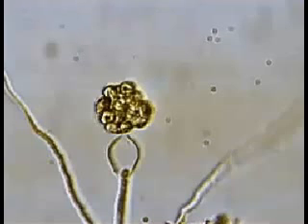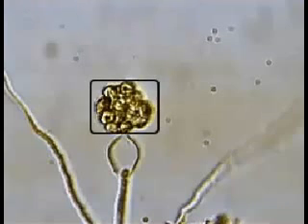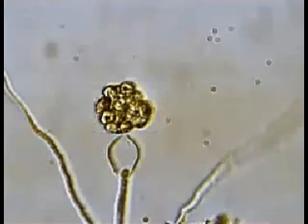to form the zoospores. And in the case of Pythium, the sporangium forms a vesicle, or sort of like a balloon-like structure at the end of the sporangium. The cytoplasm moves from the sporangium into the vesicle and then starts dividing up into zoospores. And you can actually sit there and watch with a compound microscope as that happens.